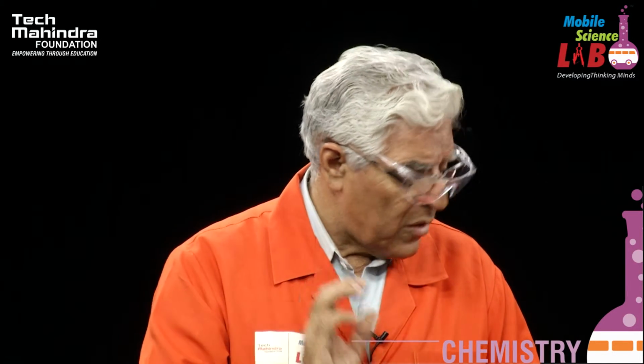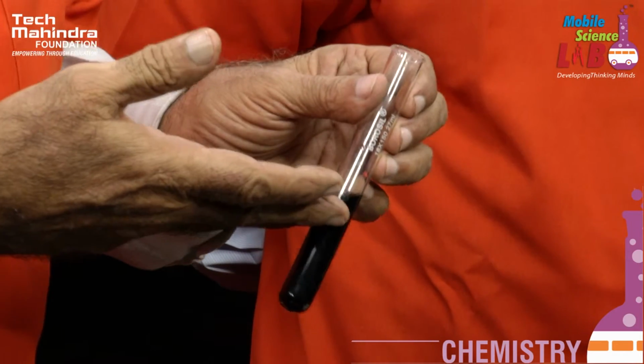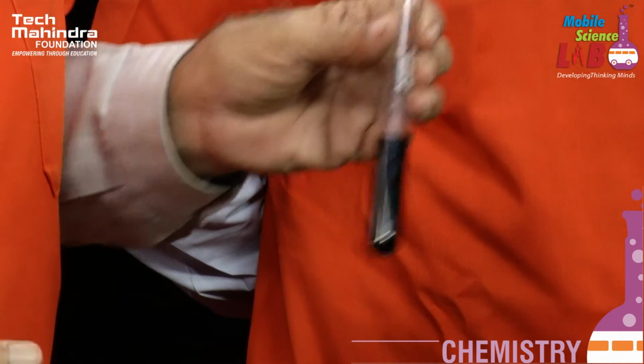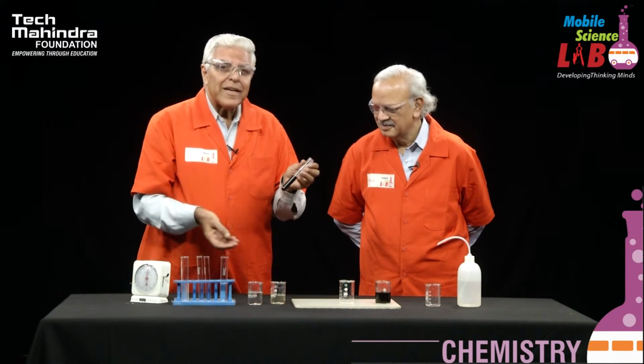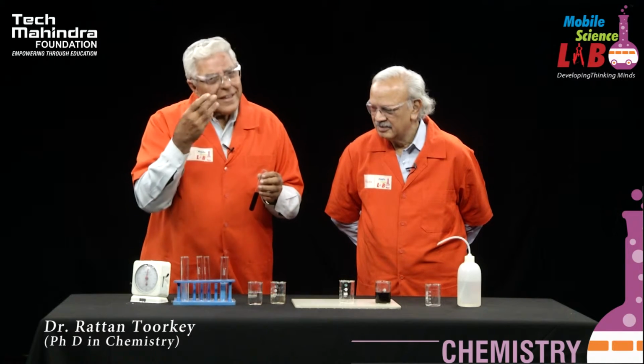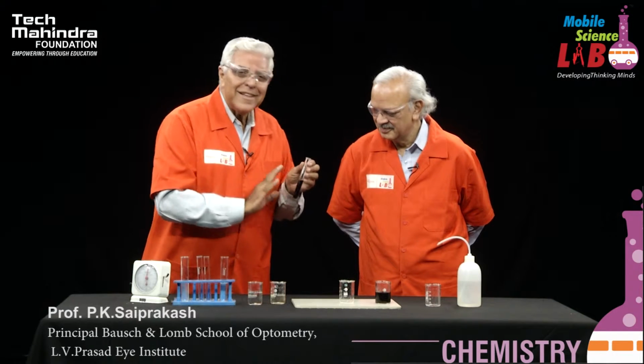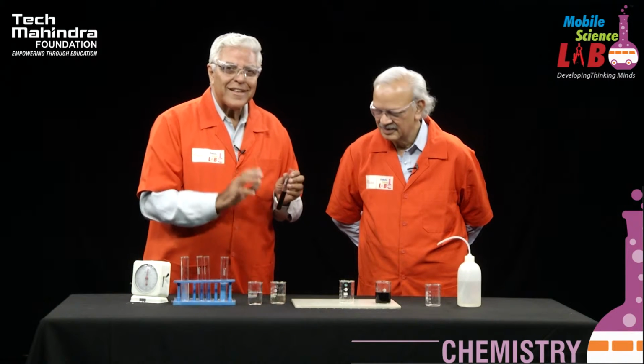But what we have done is that we have taken a very dilute solution of hypo so that it gets consumed quickly. Once it is consumed, then the iodine is free to react with the starch and get a blue color. Now again I can add some hypo into this, and again it will disappear. Again, when all the hypo has been utilized, again the color will come, and this can go on for some time. Not infinitely, but until the solution concentrations are there.